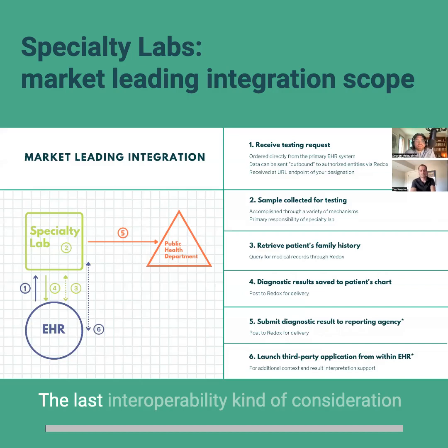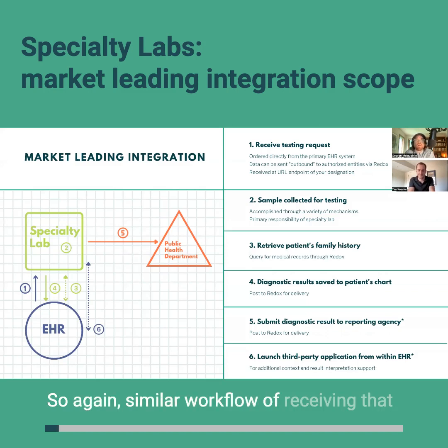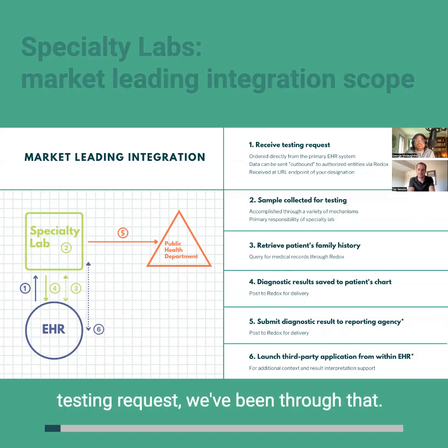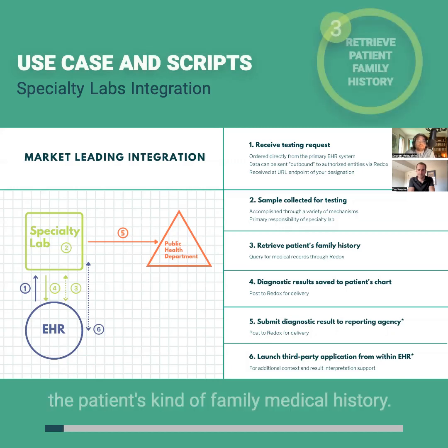So then the last interoperability consideration, or integration workflow best practice, that we have executed with partners and see as a market leading integration scope, is adding a couple more aspects to it. So again, similar workflow of receiving that testing request. We've been through that. The next thing is adding a step to retrieve the patient's family medical history.